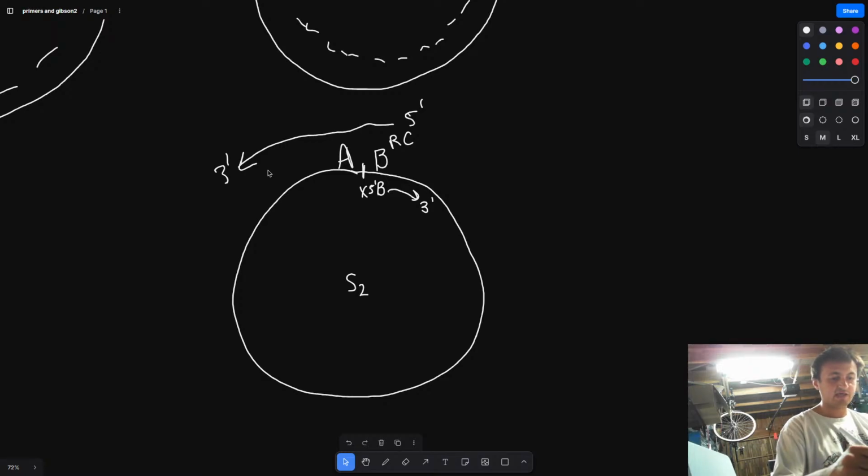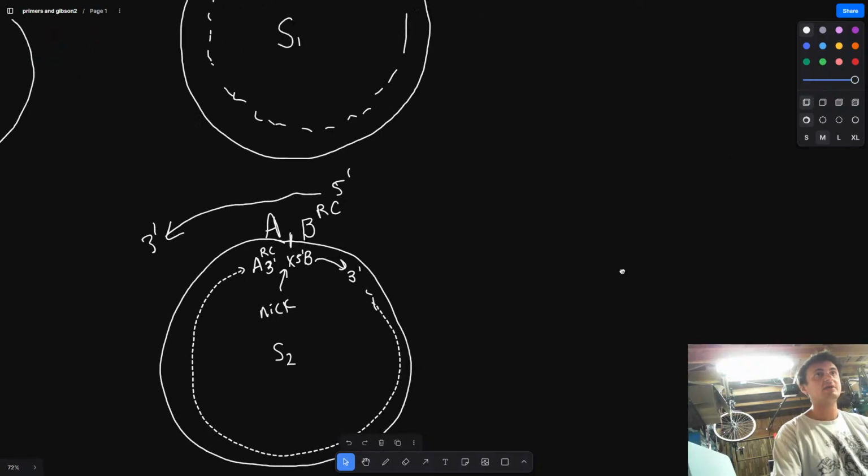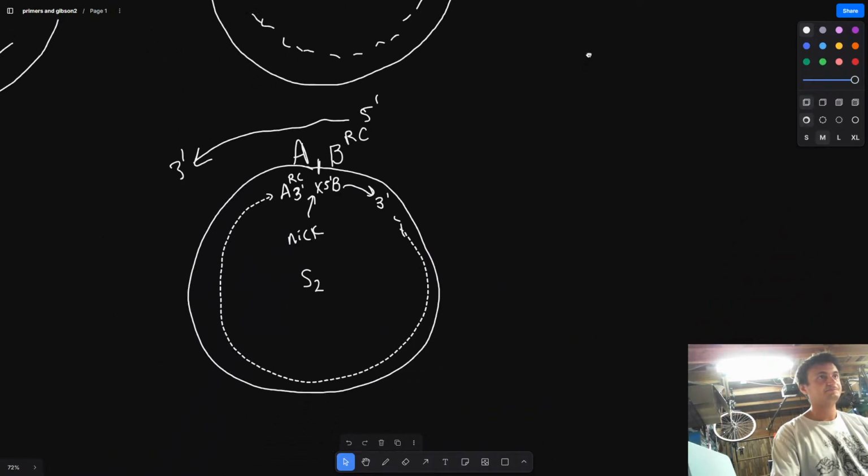It's going to wrap around, and here we're going to have ARC. And again, there is what's called a nick. I don't know how you spell this, but basically it's the same as what we said up here. DNAP does not add a bond.